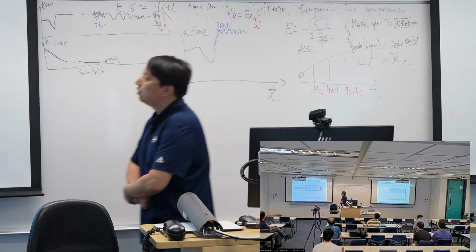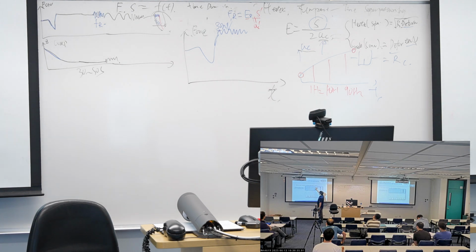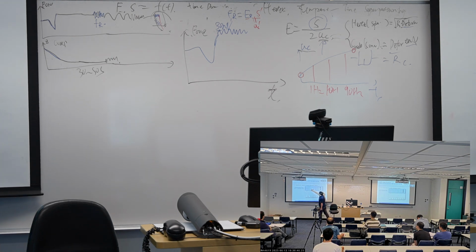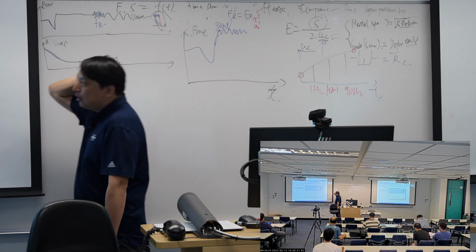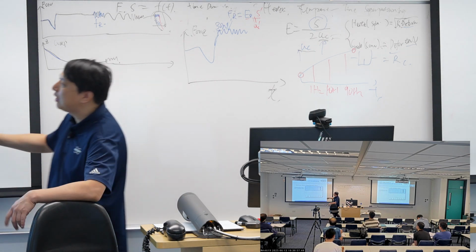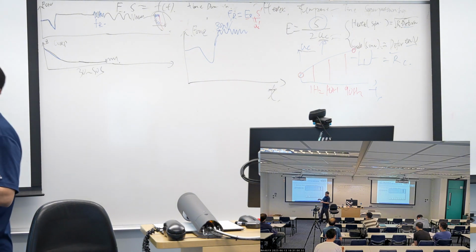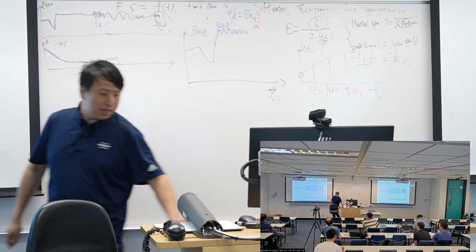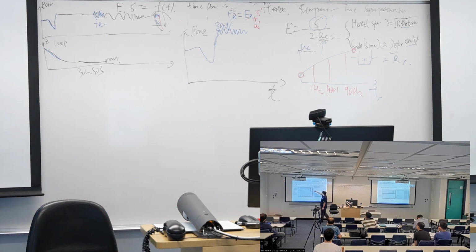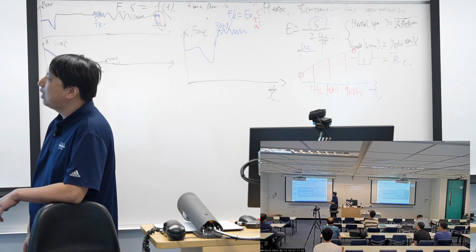And after that, we can get this kind of spectroscopy of vertical Z. It changes. It shows different segments. This is low frequency segments. This is high frequency, higher, super high, and then from each segment we can get a modulus out. We can get the storage modulus and the loss modulus and the tangent delta.